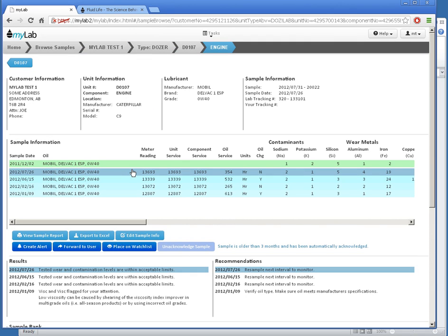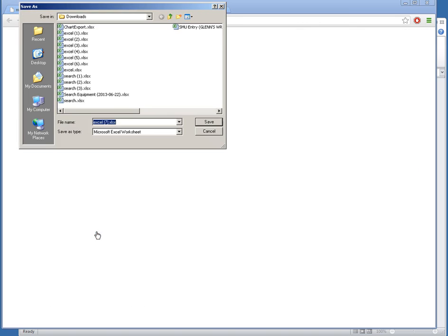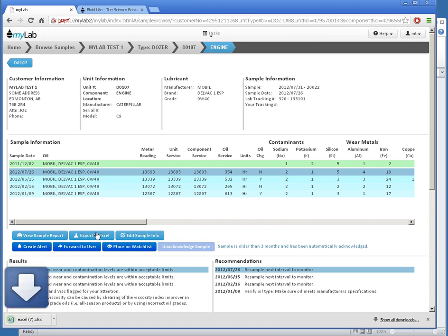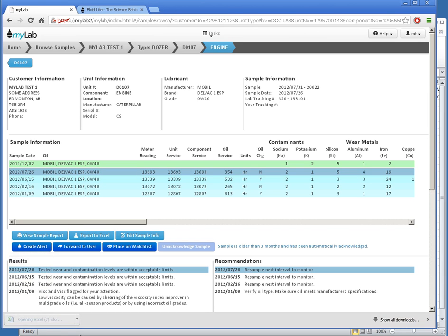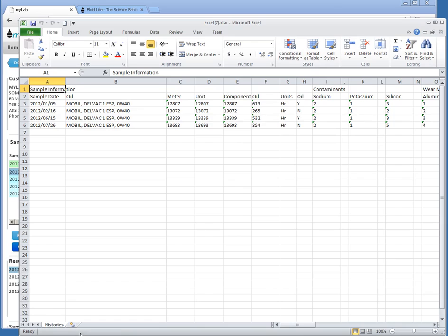Now that I'm looking at the results, I simply click the Export to Excel button. I open the resulting file in Excel and I have my results.